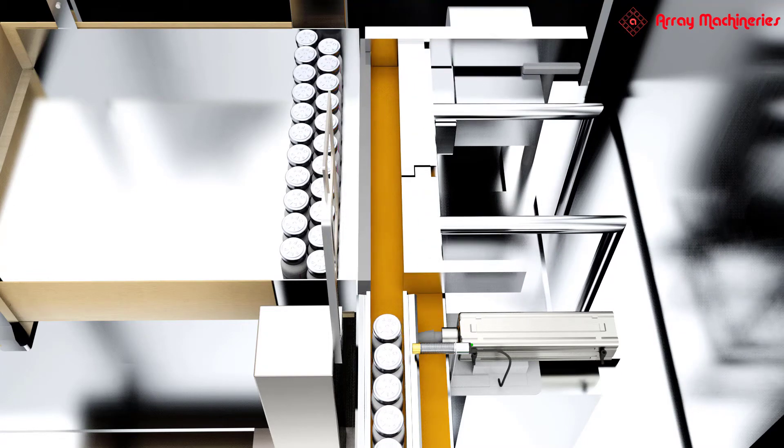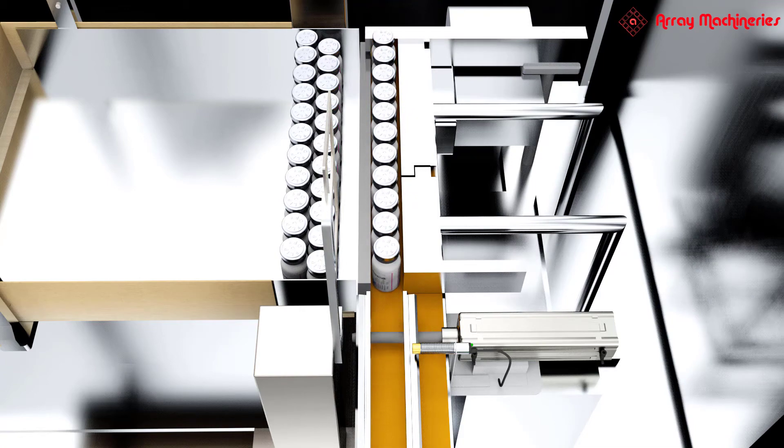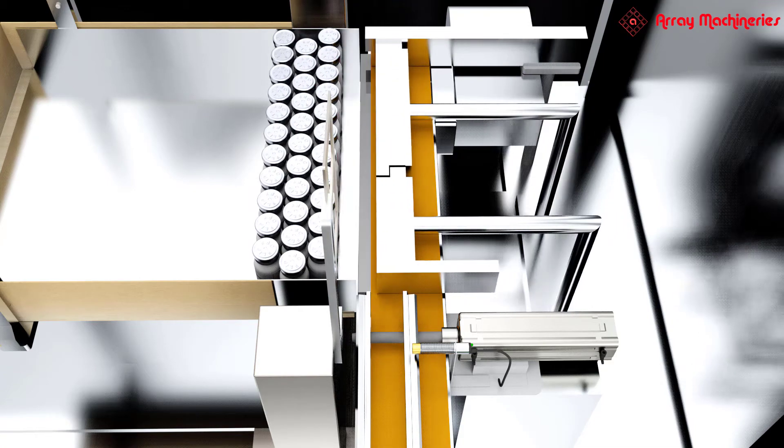Once the pusher reaches the tray, the servo conveyor starts again and sensor and stopper 1 let pass the next vials.